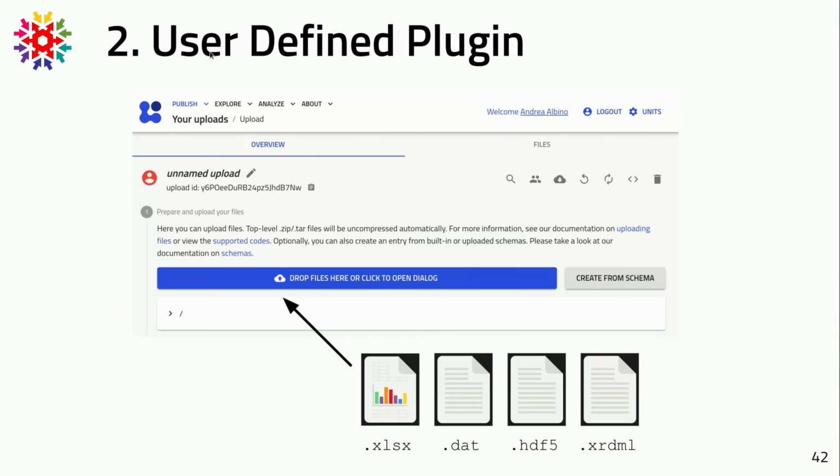What is now the point is about plugins. The main feature we get when using a plugin is that we can attach, as I said, some automated processing. In this case, we can drag and drop the raw files in our ELN and get automated processing. This means that the archive files are automatically created, and the metadata is extracted from the raw files and filled into the archive files that we created.